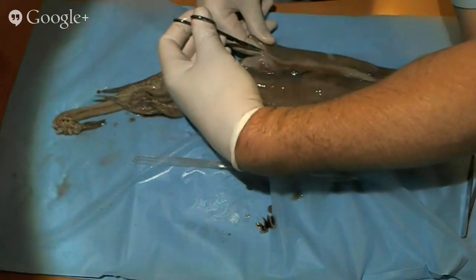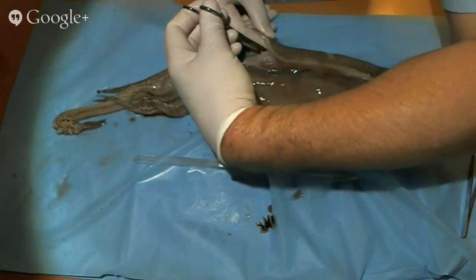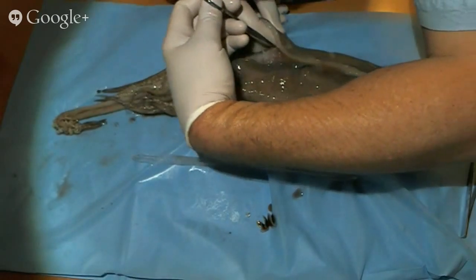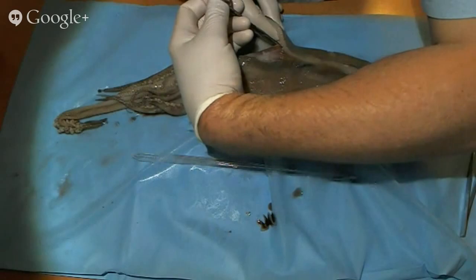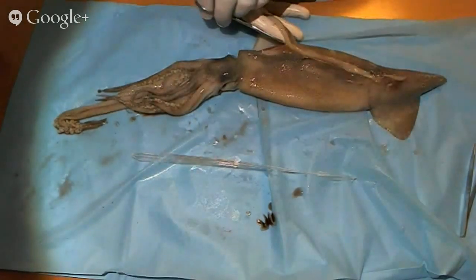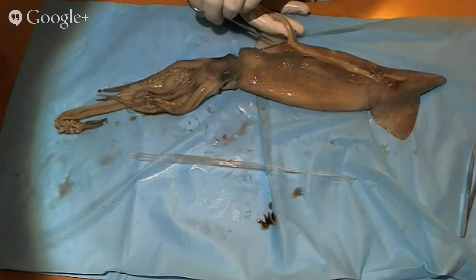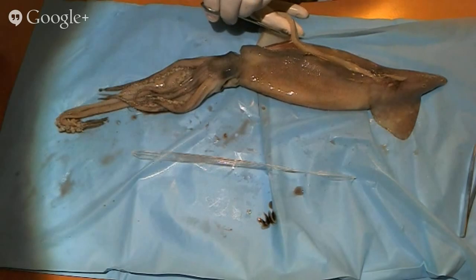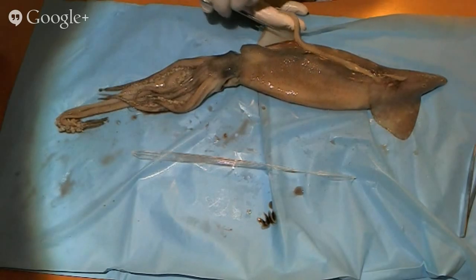If the squid is using its strong muscles, then it needs something to push against sometimes, rather than just totally contract. But I'm going to tell you that is totally a guess, so if anybody wants to correct me on that, I'm okay. I would appreciate it, that is.